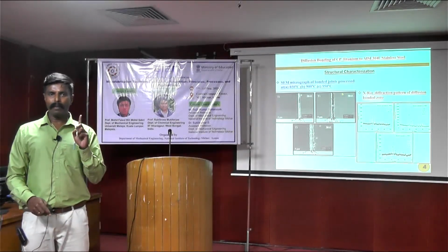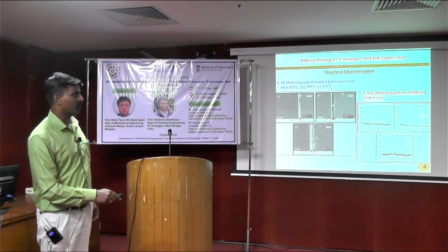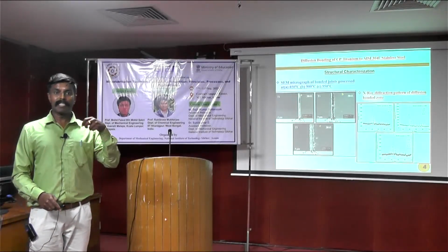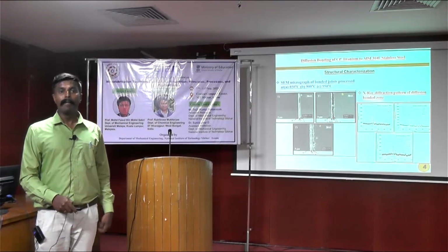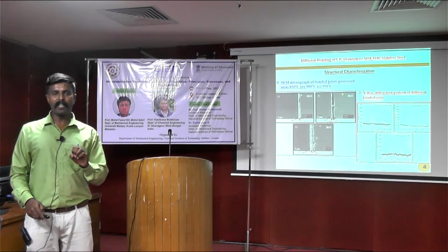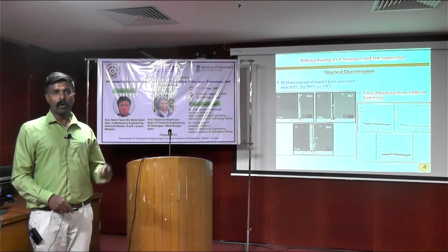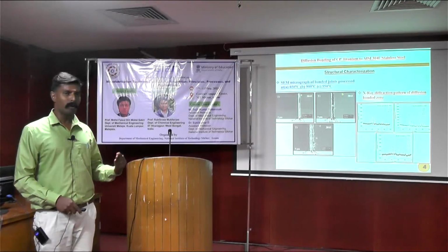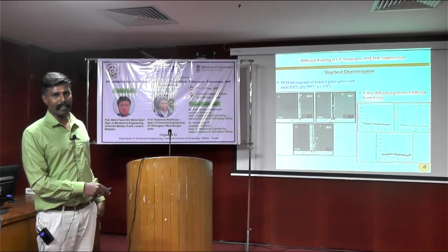So one piece of information we noticed is that even with the solid state welding process, there is an evolution of Fe2Ti. Other intermetallic compounds like FeTi or some Xi phase may also form, but they are not detected in the X-ray diffraction because of a limitation of the technique. X-ray can detect a compound only if its volume percentage is more than 5%. The evolution of FeTi and other intermetallic compounds may be less than 5%, which is why they may not be detected by X-ray diffraction.